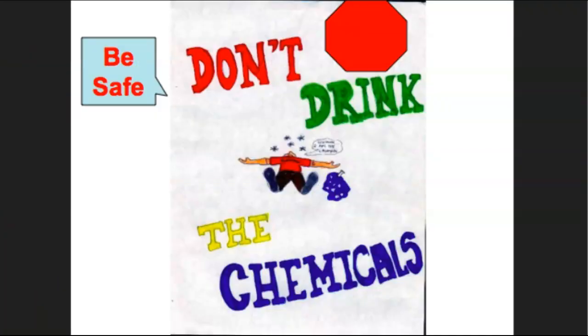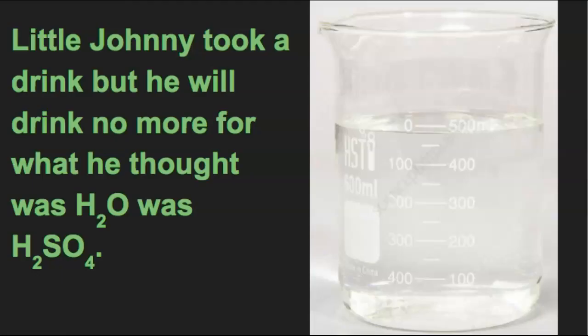Remember, don't drink the chemicals. Be safe. Shouldn't have to say it, but you never know. Some people like to dare each other to do other things. Some people think it looks like water, but it's not always water. And that's where our next slide is. It says, little Johnny took a drink, but he will drink no more. For what he thought was H2O was H2SO4.